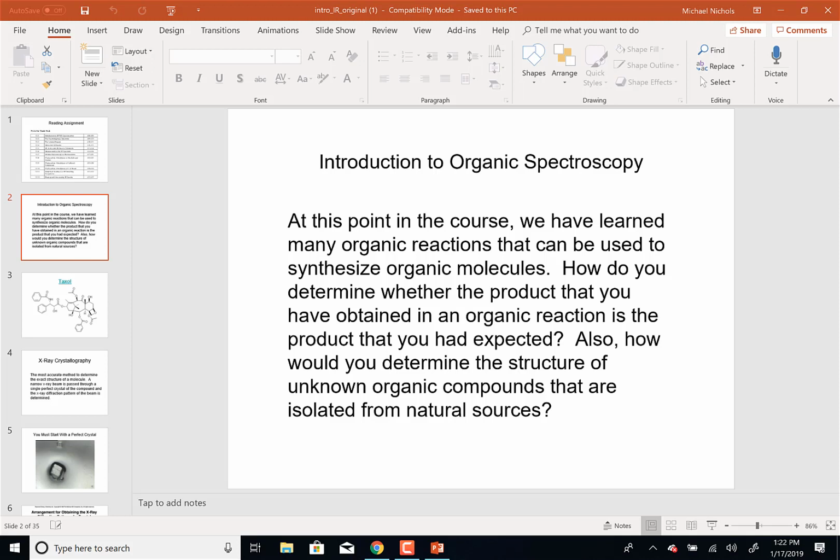So we're going to talk about how you determine the structure of a molecule from scratch. How do you determine whether you made the molecule you think you made in lab? How do you know it's pure? Right, because so far we haven't done anything really with percentages outside of GC. Right, melting point doesn't give you purity. Right, in your lab report you said, well, I think it's kind of pure because the melting point is actually. But now we can get some analytical data and say, oh, it's 90% pure. But we can also determine what the impurity is and what the side products are. So that's what we're going to do with spectroscopy.